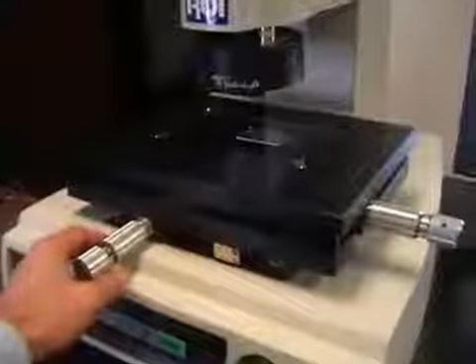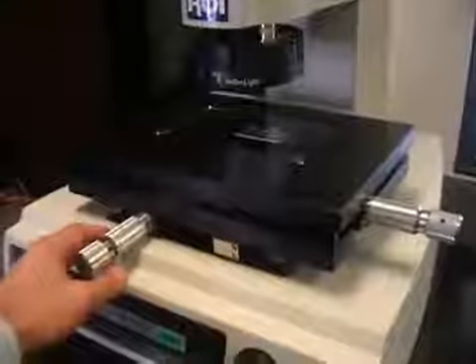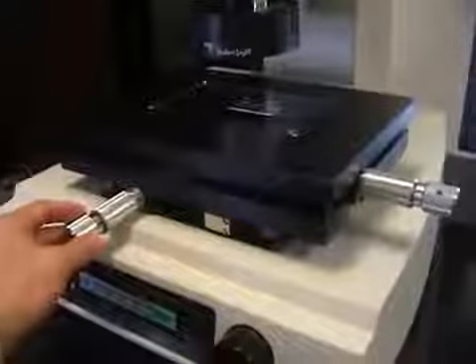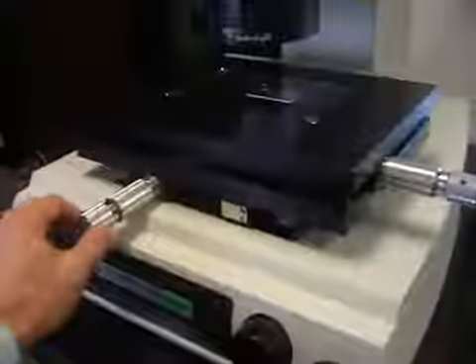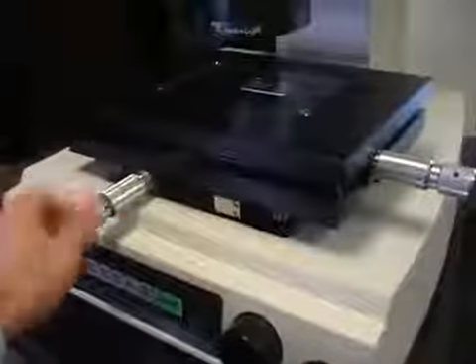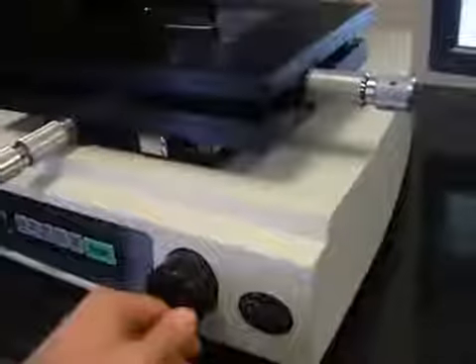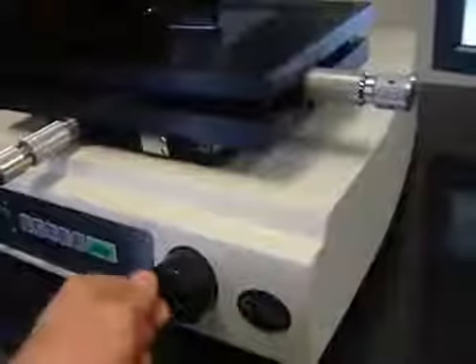The X and Y are a unique mechanical design which allows rapid and fine adjustment off the same axis knob here. The larger knob here provides a rapid adjustment and the inner portion of the knob provides a fine adjustment. That's the Y axis. The X axis behaves the same way. The Z axis knob is down here in front and provides the ability to refocus the optics.